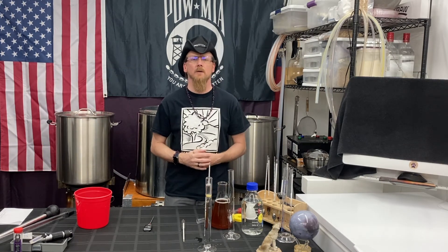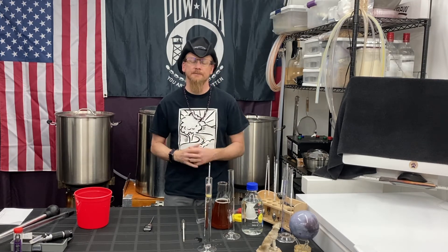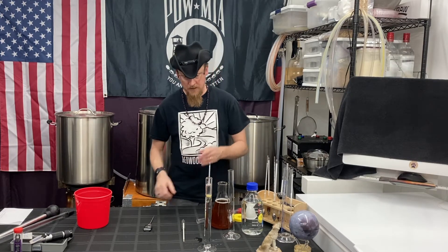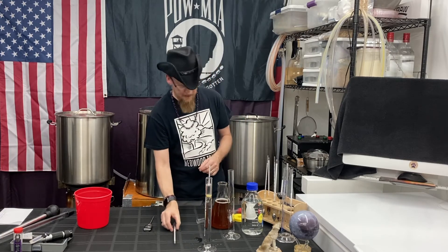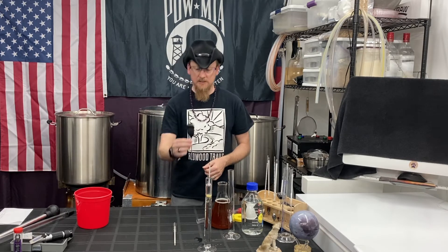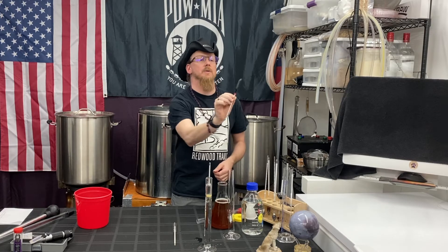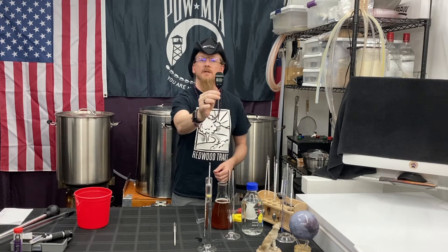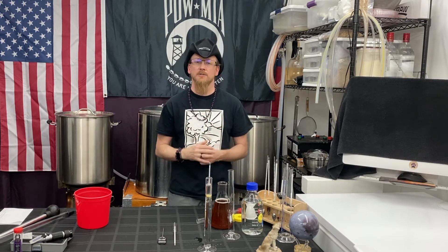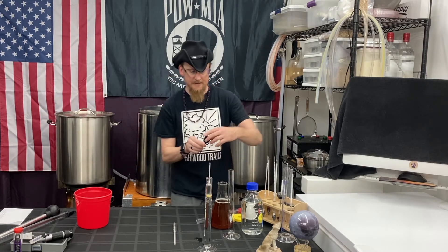Why is it lower than 1.000? You have distilled water — how can that be? All hydrometers are calibrated at a certain temperature. All of mine happen to be calibrated at 60 degrees Fahrenheit. As you can see on my instant-read thermometer, it's showing 91.7 degrees in my brewing area. So we have to adjust our specific gravity based on temperature if it's not right at 60 degrees.